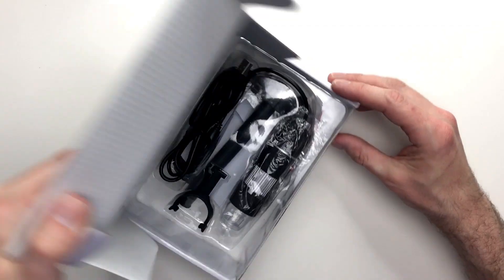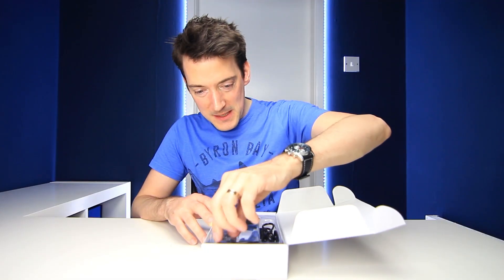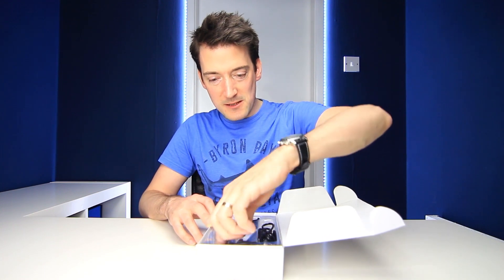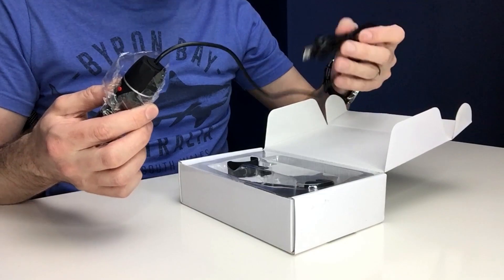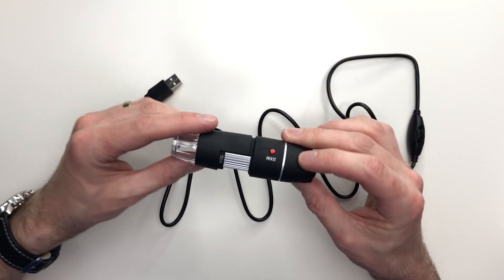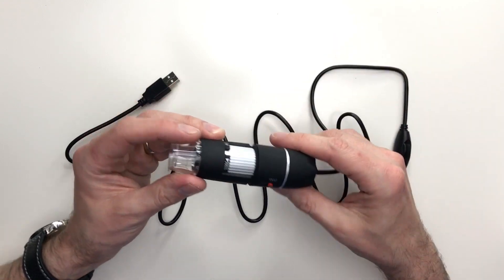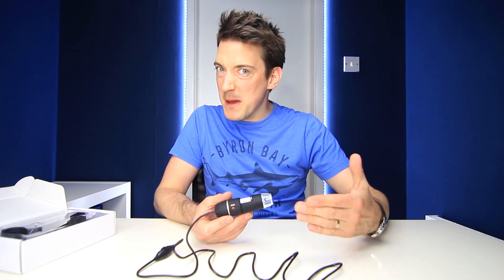Opening it up now, that easily slides out. There it is — nice presentation. We've got what looks like the actual microscope itself, and that has got a pretty long USB lead on there, which is always good. Whoa, look at the size of that, that is super long. And then the microscope itself — that actually feels quite nice. It doesn't feel expensive, but it does feel fairly well made.